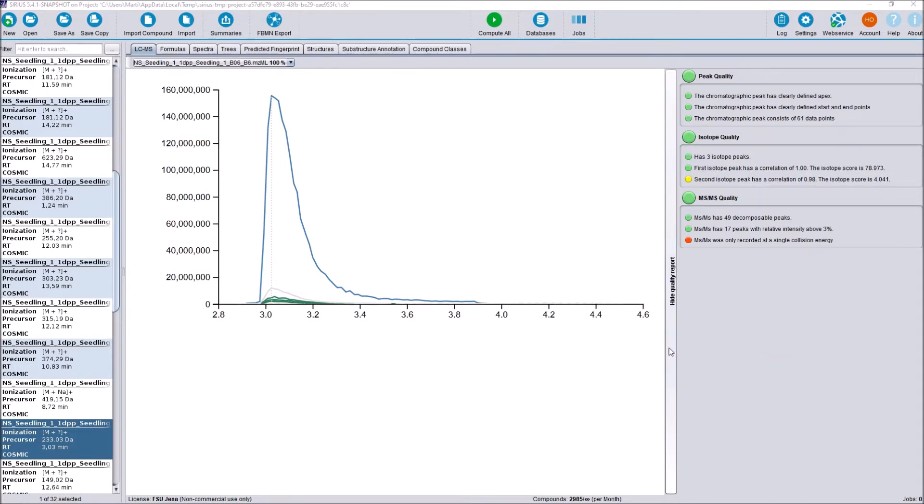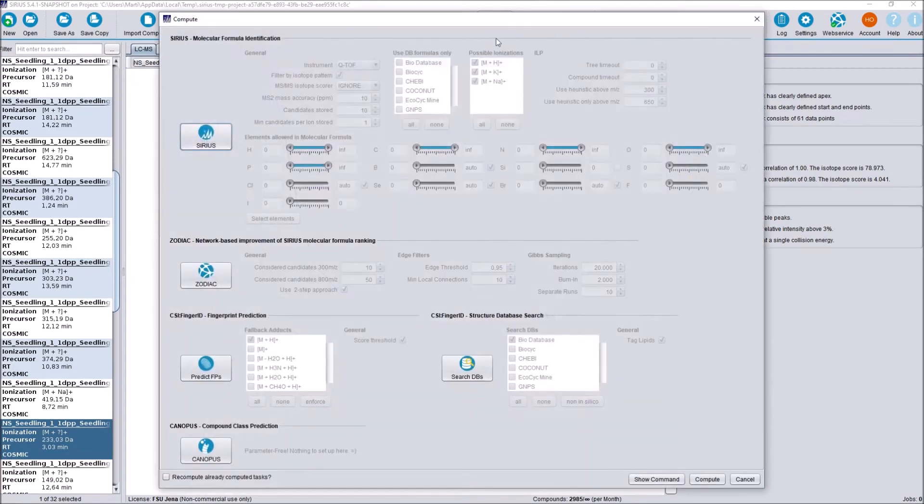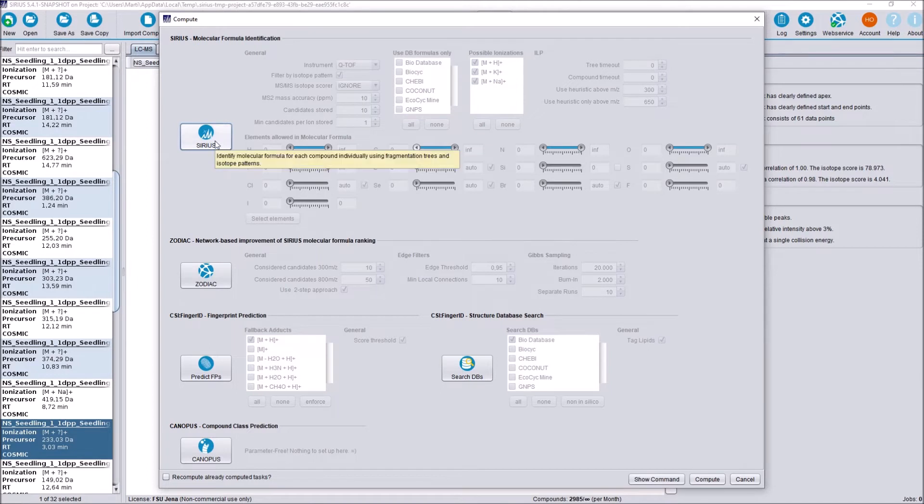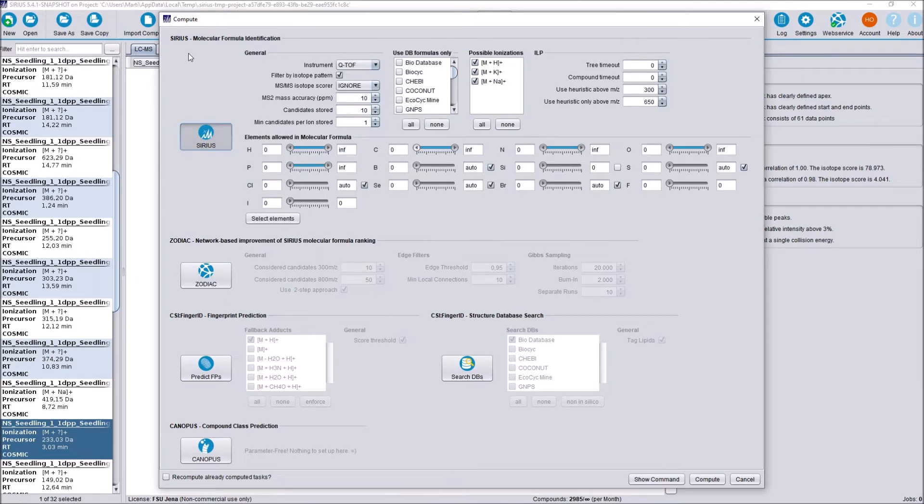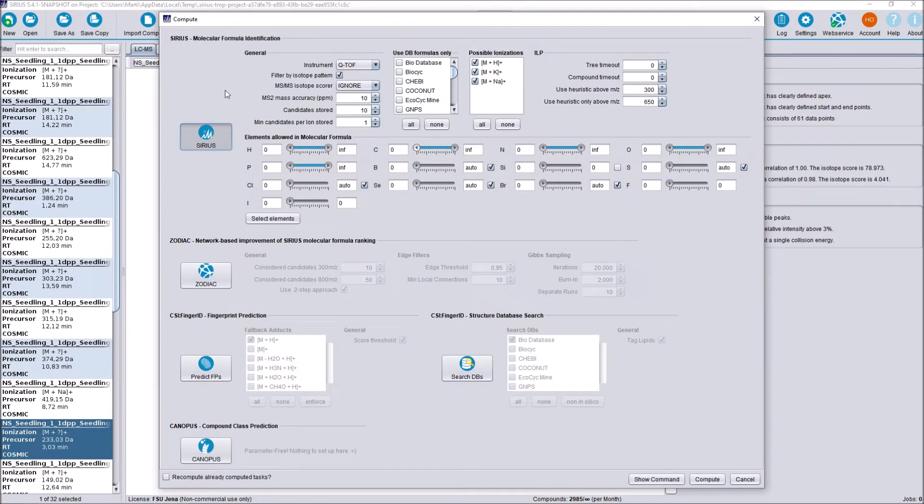Now we can start our computation. As usual, we are going to compute all here to go over the changes in the compute dialog. For starters, in the SIRIUS molecular formula identification part, you can see some minor description changes here. These, however, are only text changes. There are no functional changes. It's only to improve clarity.